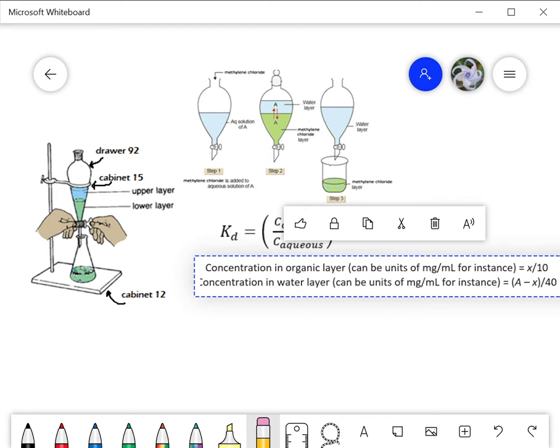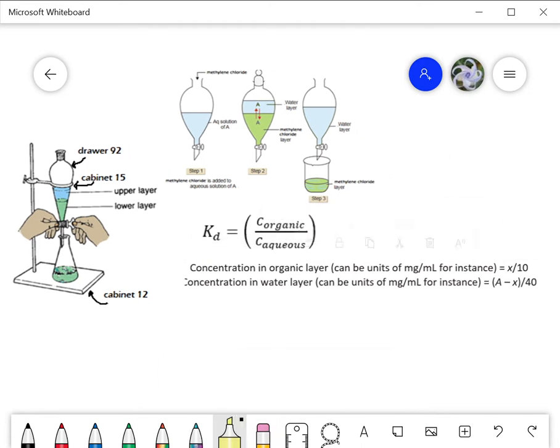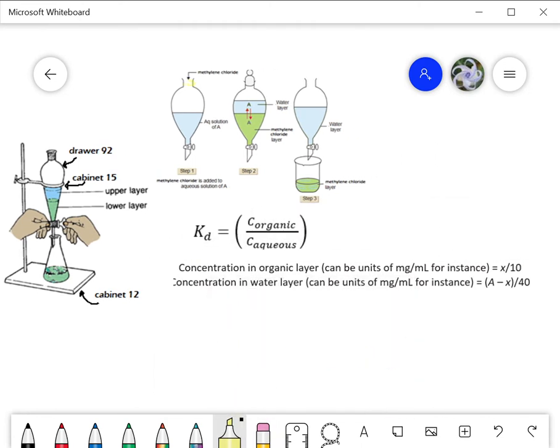A separatory funnel has a conical shape with a few important pieces: there's a narrow part at the top, then a stopcock, and that triangular shape at the bottom is designed so that when you have two layers it becomes easier and easier to separate them as you go towards the narrow neck.